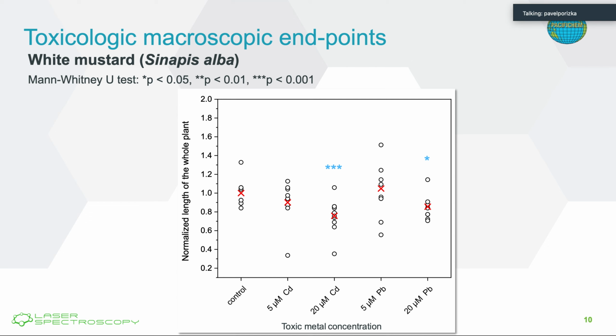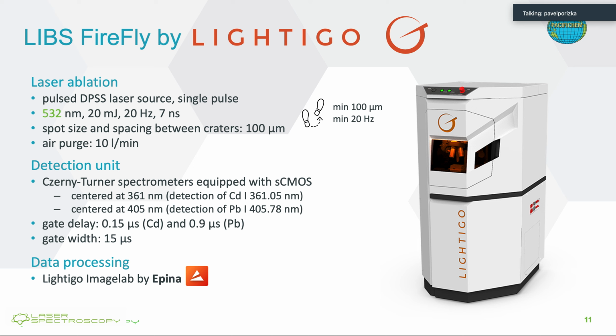So lead content is not that severe to the plant growth, but there is still some change in the growth, and you can see on the plant by visual comparison that there is something happening, but you are not able to see that by naked eye when just having low concentrations in the cannabis. So we are having this standard toxicity test. We are also working on ICP-OES. I'm not going to show any results. They are just pending right now, those experiments. I'm just going to show some results that we have from LIBS.